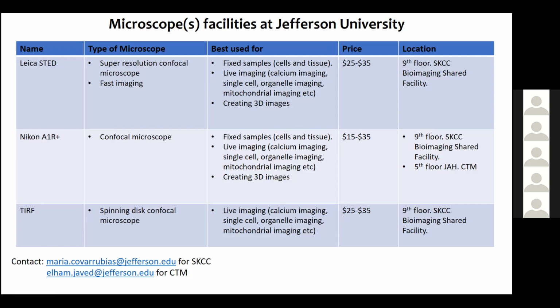So the main imaging facility is on the 9th floor of Sidney Kimmel Cancer Center, and the person in charge over there is Maria Covarrubias. So you will get in touch with her. She's going to send you the link for the iLabs. That's how you are going to make an appointment for it.